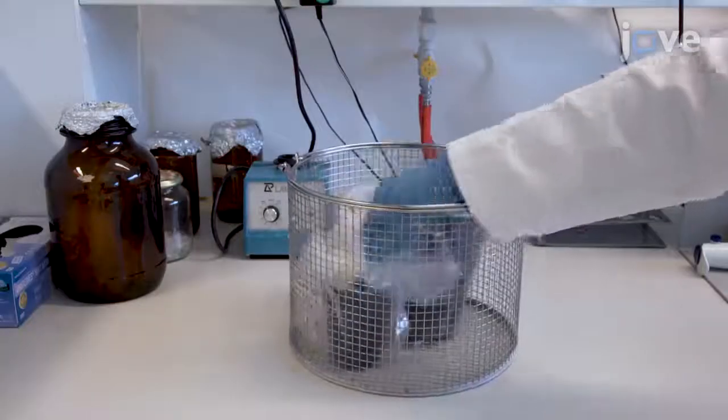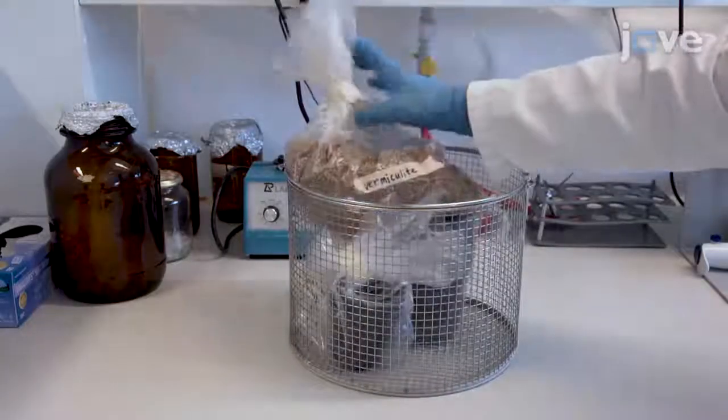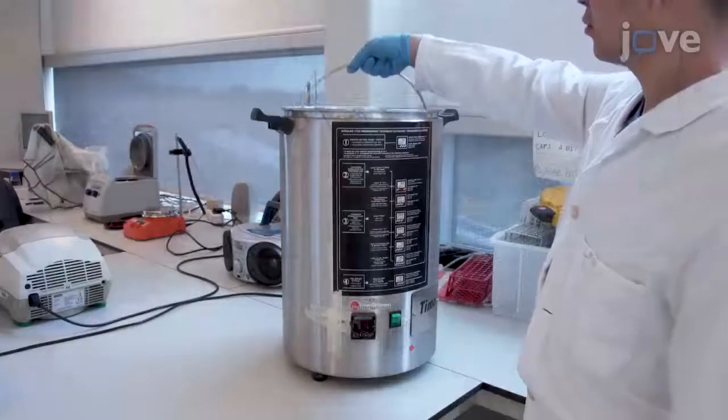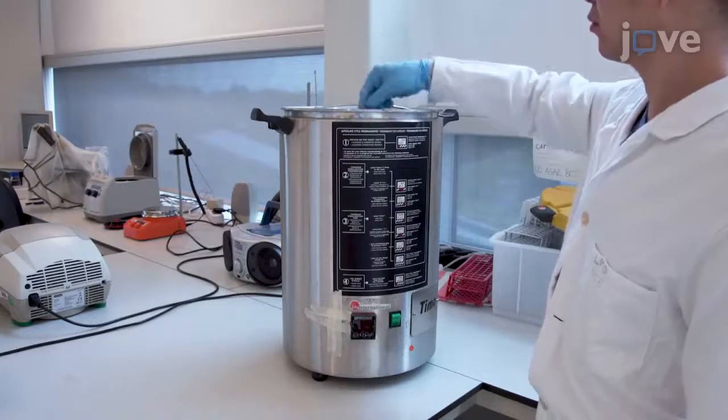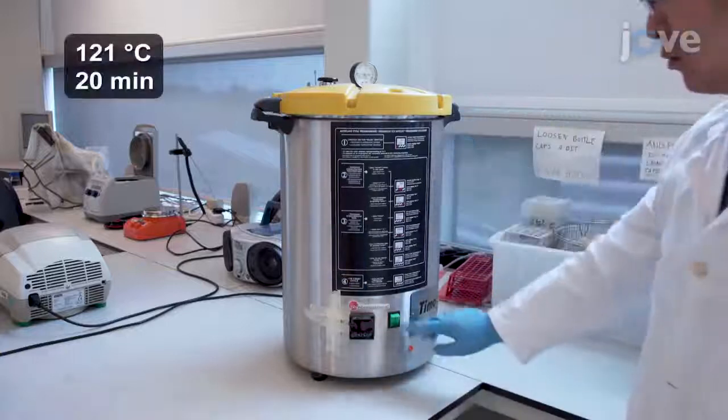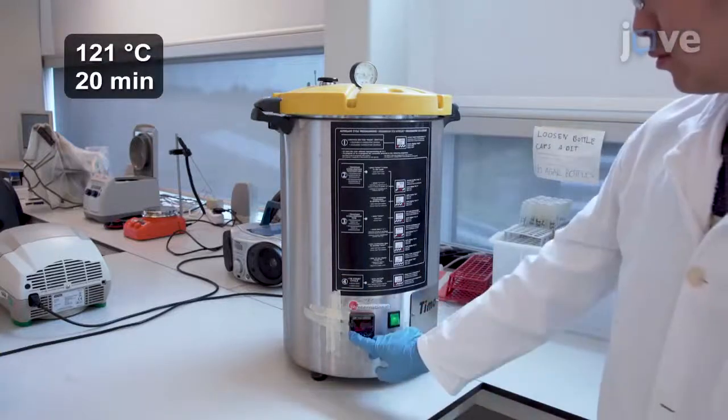Next, prepare the materials needed for germinating and growing potato tubers. Sterilize the plastic pots, engraftment baskets, vermiculite, and water by autoclaving them at 121 degrees Celsius for 20 minutes.